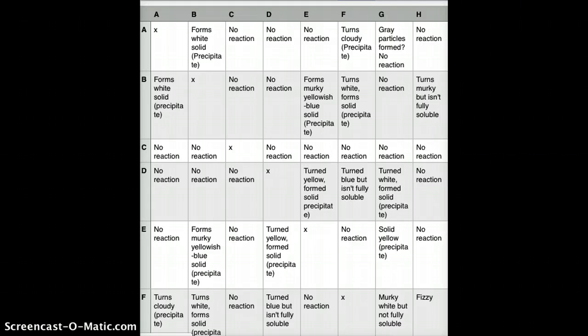Several of the substances didn't react at all. Some formed a gas, and some produced a precipitate as a result of a chemical reaction. The table provided shows what we recorded as a result of the observations of the substances reacting together. To be able to understand the table, we have laid it out into a form where each of the substances are in the far left of the table and each of the substances we reacted it with across the top. From there, we put our observations down. Although they are listed twice, each process is only tested once and the table is set up to read easier.